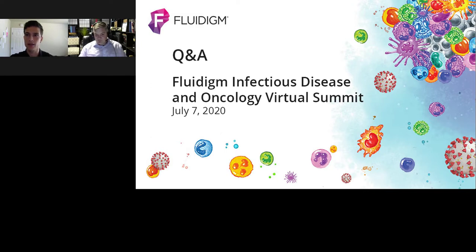All right, and it looks like we're going to have time for one more question here. Can gating analysis be automated, or do they need to be adjusted manually from sample to sample? Yeah, it's a great question.